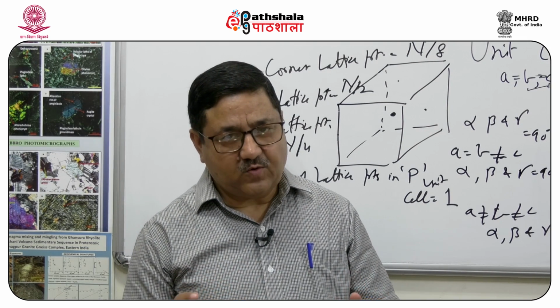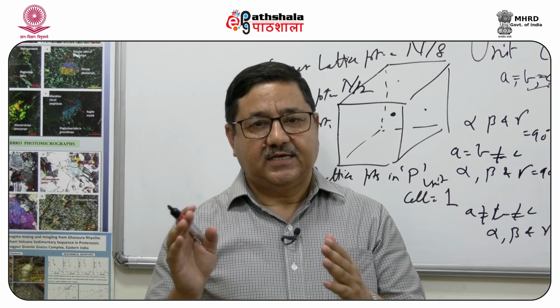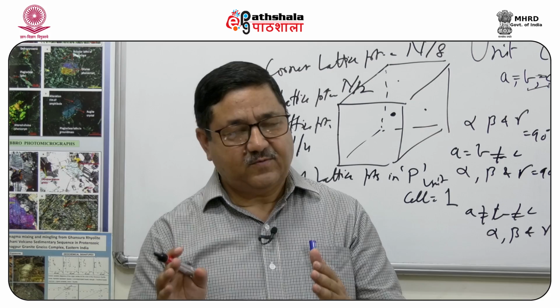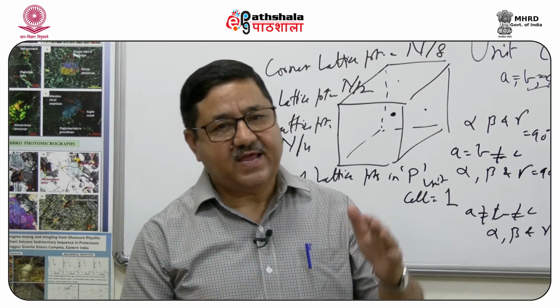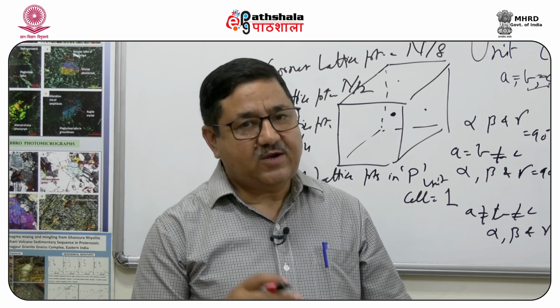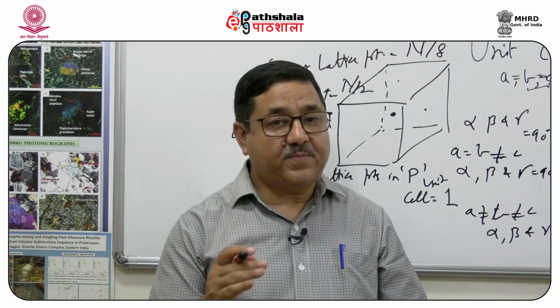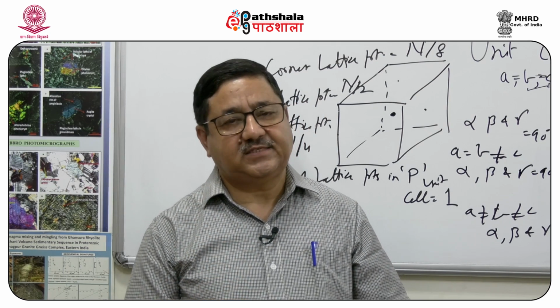So, with this background of the definition of the crystal, the unit cell, which can be primitive or non-primitive, and the crystal systems, we try to investigate or understand the property which we are determining through X-ray diffraction.